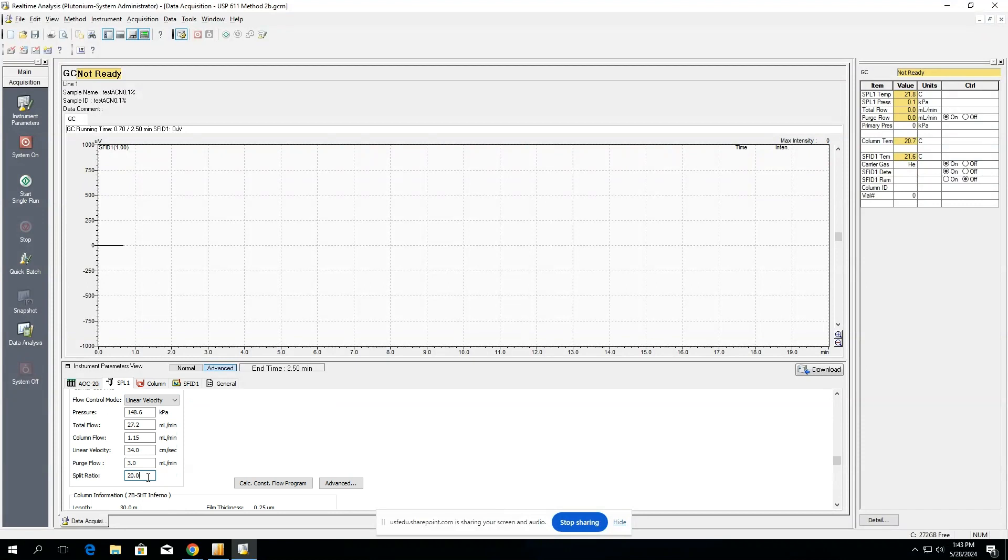If it says one to five, you can imagine it's one divided by five, which is twenty percent, and that's what we put here. For the purge flow, this is whatever velocity we'd like to bypass the column. This will depend on your method, but typically around the value of three is okay. It might have to be lower, but it's typically not going to be higher.